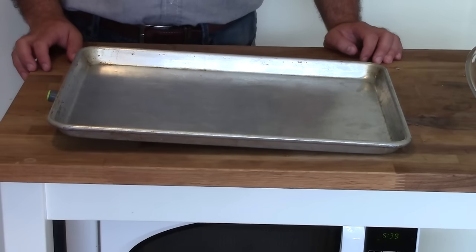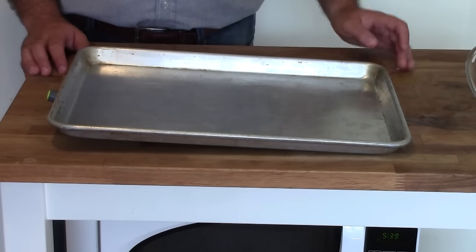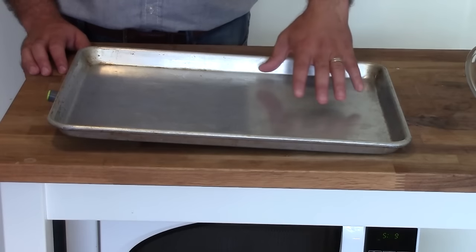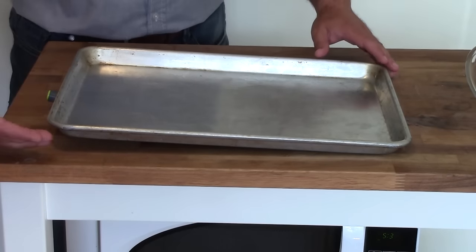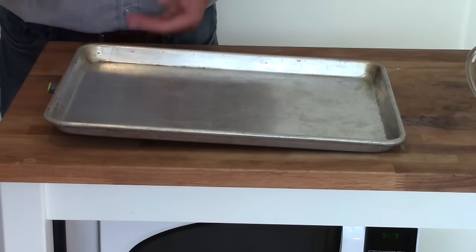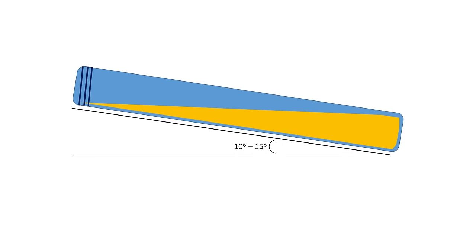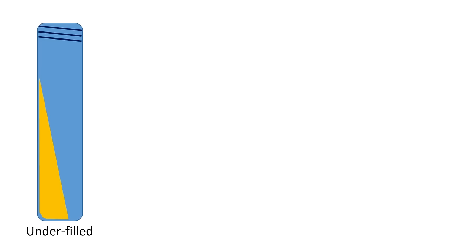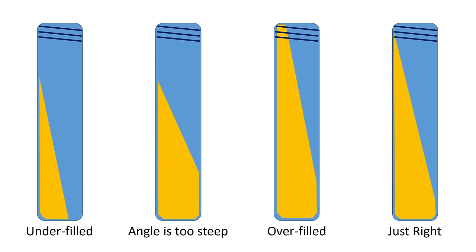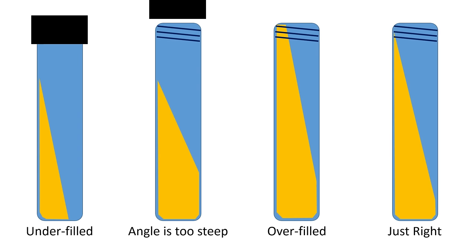While your tubes are sterilizing in the pressure cooker, you're going to want to get your casting station set up. And that's what I've done here. So you can see here, I've taken a flat cookie sheet, and I've elevated one side, this side here, just very, very slightly. In this case, I've actually used a little wine topper. Another very common mistake that people make is they don't angle this tray low enough. You want the tray almost flat. Ideally, when a tube's been cast, there should be minimal media on the base of the tube, and then the slant should go all the way up to the very top of the tube. You're trying to maximize the area of the slant to maximize your growth surface. You also want to make sure you haven't underfilled the tubes, because you also need enough media to ensure there's ample food for the yeast to grow, as well as ample volume to absorb any toxic metabolites.